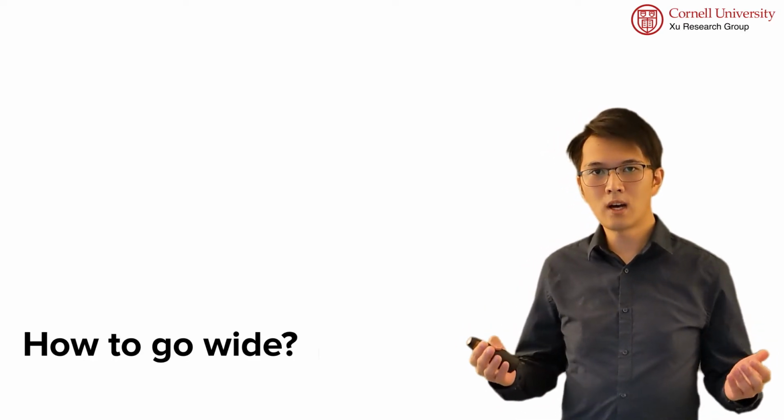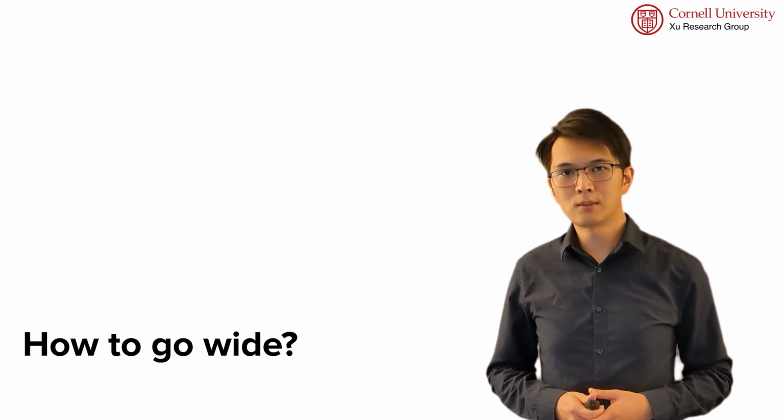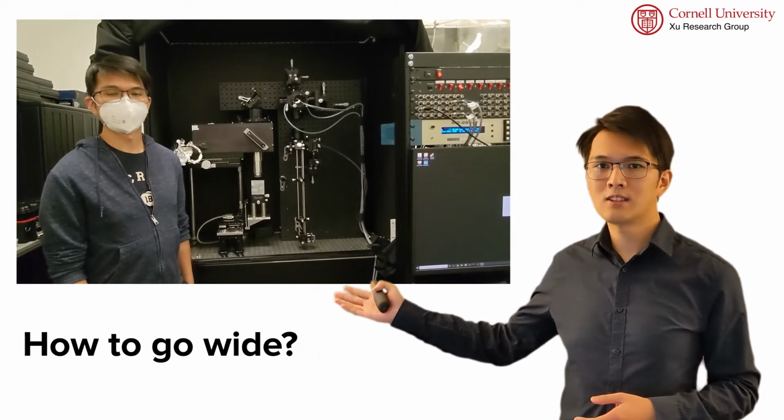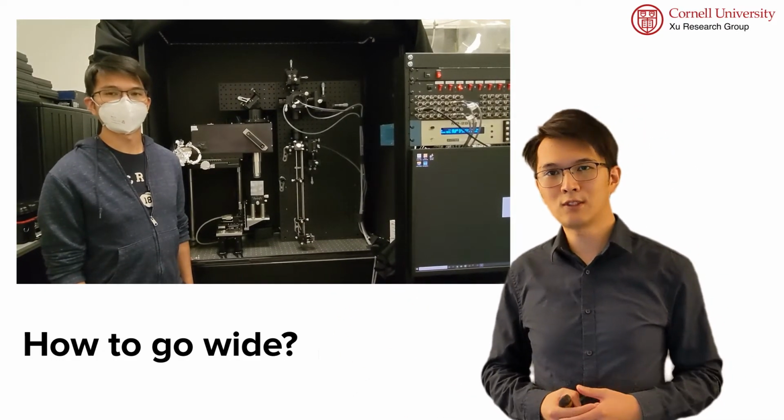But how can we go wide? In order to do that, we need a large field of view microscope. So here I have my lab rat Aaron to introduce live in the lab our 3-photon large field of view microscope.